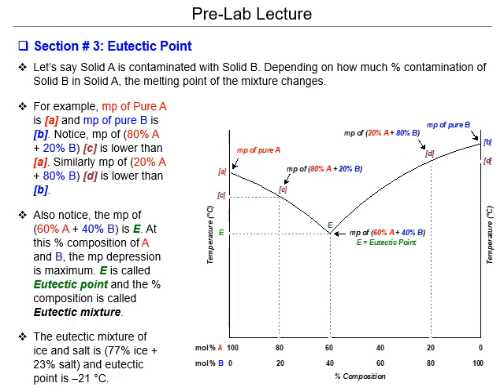The mixture in this case, if you look at the graphs, is 60% A, 40% B. So that is basically anytime you have two different substances together, the melting point, like we said earlier, is always going to be depressed, and the lowest temperature that you can get out of it is called the eutectic point. And you can figure that out by doing a bunch of different experiments, varying your percentages, and graphing them, then finding where that lowest point is, which in this case is 60% A, 40% B.